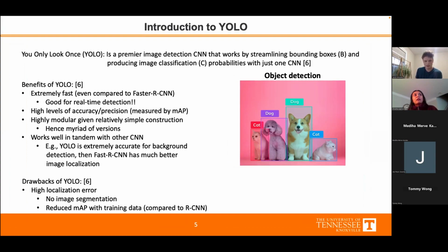Okay, so in all the beginning versions, especially in YOLO v1, they have this concept of providing the bounding box with respect to the grid. So there was no concept of anchor boxes. So what are anchor boxes? They are predefined boxes that you create. For example, in our case, we have voids.